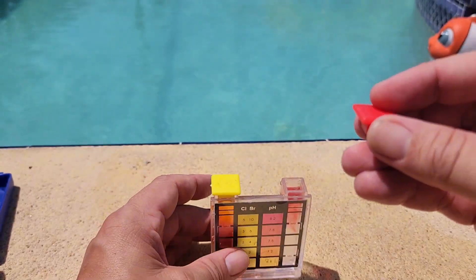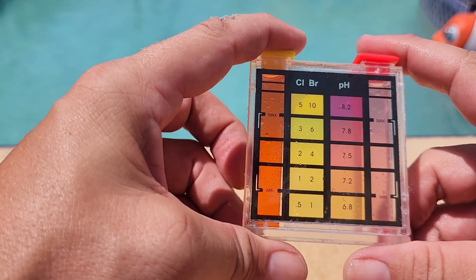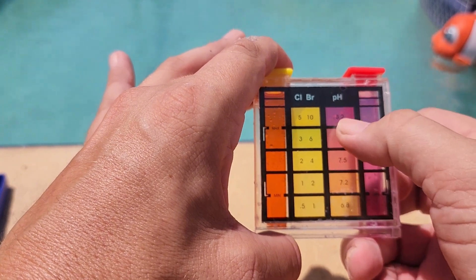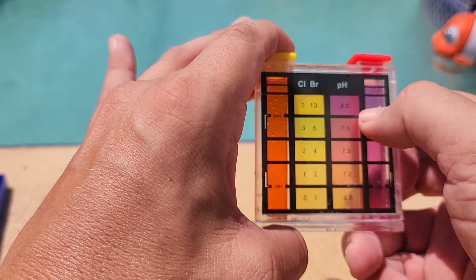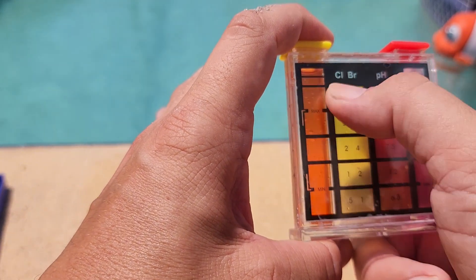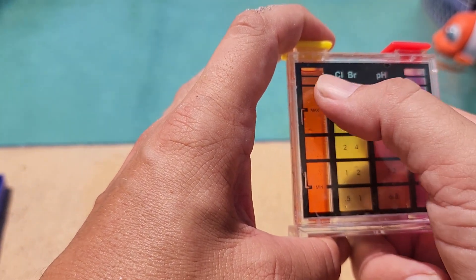We put our little cap on, give it a good shake, and looking at this, it's quite interesting. I can tell that my pH is right around 8.2, which is really high, and I may need to bring my pH down — I have some pH down that I can use. On the other side, I've got orange for chlorine, and my chlorine levels are really high.